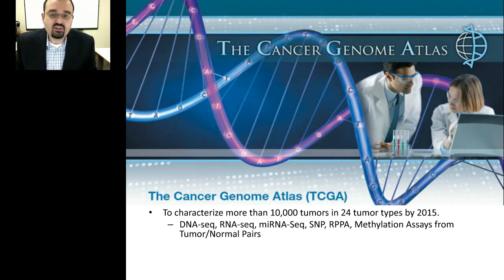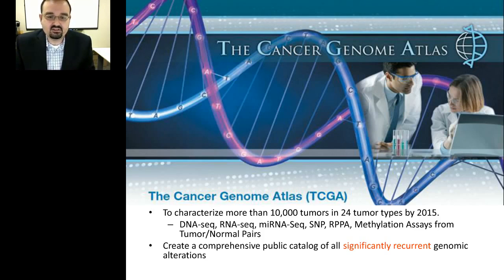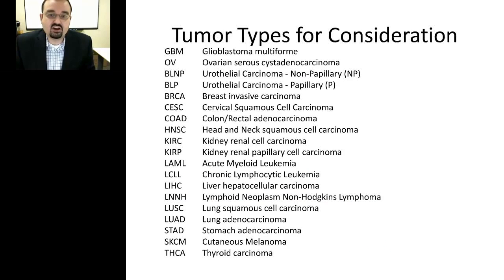We also know that these accumulated mutations in key tumor suppressors and oncogenes then translate into differences at the RNA expression level. Here I show a principal components analysis of some example data of 10 normal tissues and 10 tumor tissues, based on RNA-seq expression.